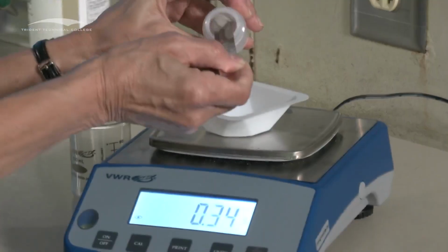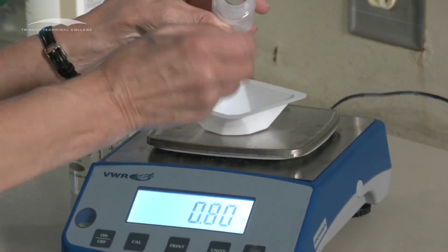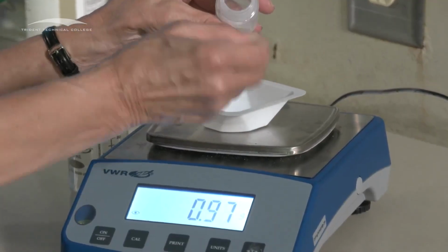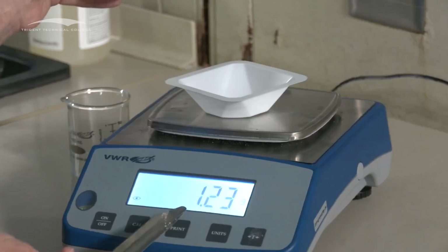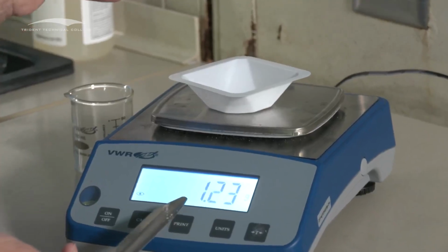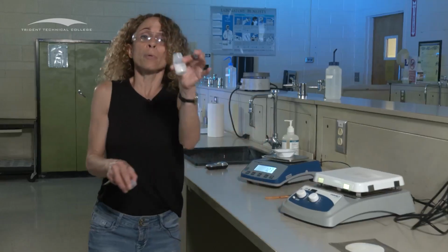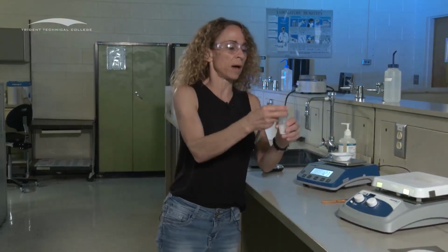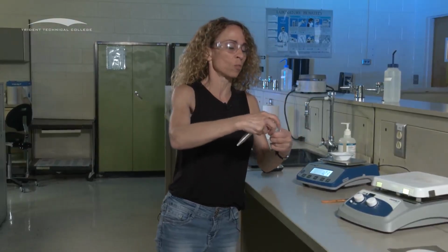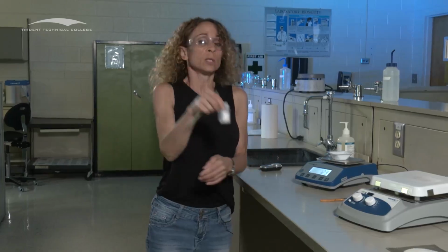But let's say I'm adding, and then someone comes up and for whatever reason, right? Oh no, look what happened. I am over 1 gram. This can't be happening. Do not put it back into the bottle. Once you take the solid out of the container, it is now contaminated. So the worst thing that you can possibly do is put it back in here.